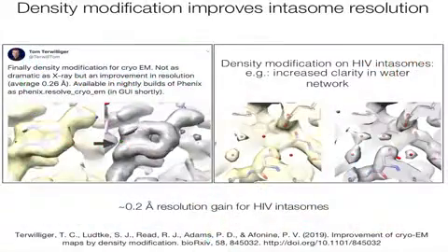Now, all the analyses that I'll describe from here on out were performed with the maps that I just introduced in the previous slide. So these maps resolved to about 2.6, 2.7 angstroms in the active site. But actually, in the last several months, we saw this tweet from Tom Terwilliger showing the new density modification tool implemented in Phenix, which improves the phases of cryo-EM maps. So he suggests that one could see, on average, 0.2 angstrom improvements in density maps for the cases that were evaluated.